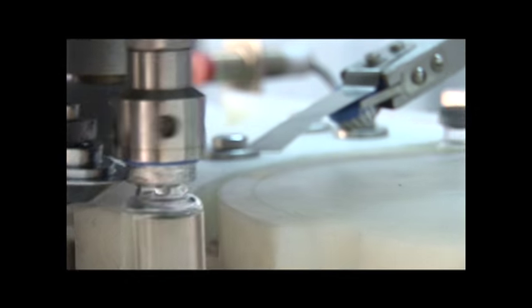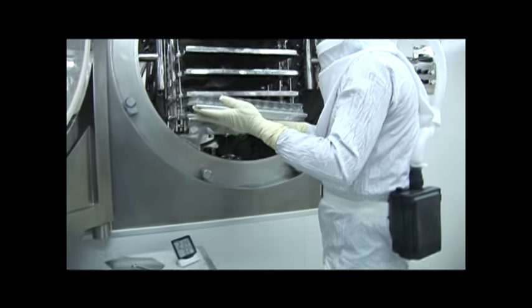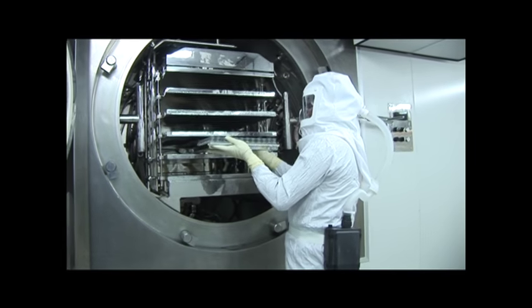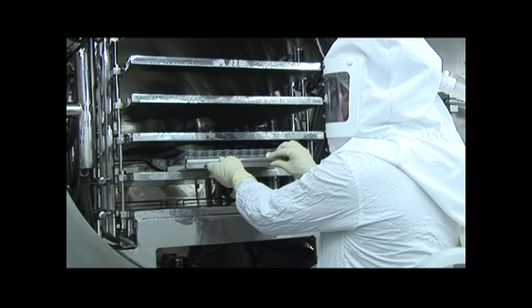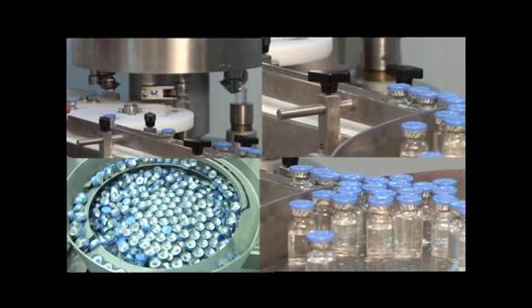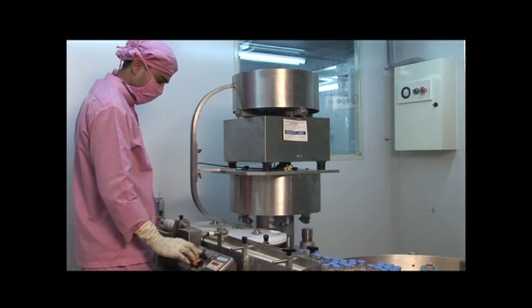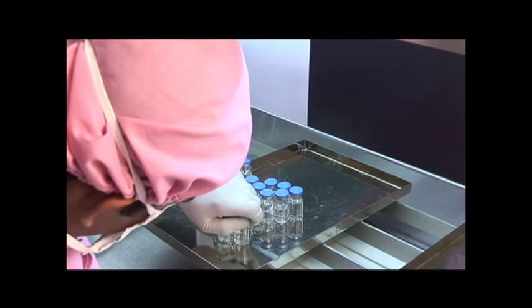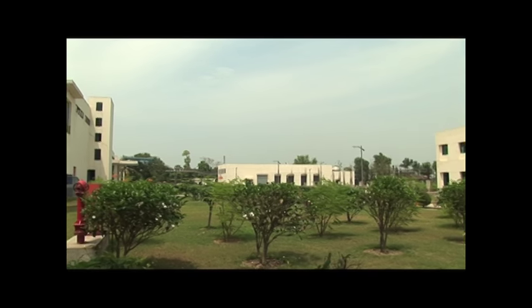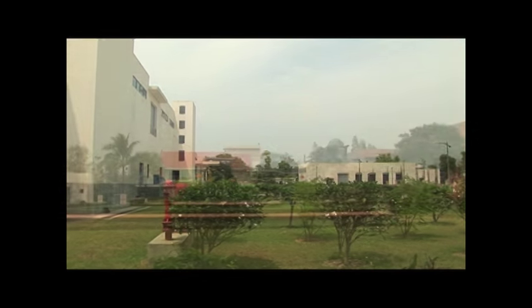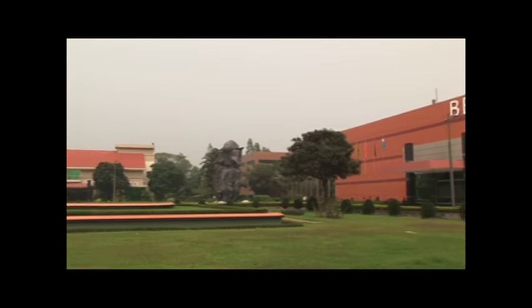Beacon, the first pharmaceuticals company in Bangladesh, introduces isolator technology for processing anti-cancer products which segregates people from the cytotoxic products and prevents exposure of products to the room environment. With unique manufacturing facility, today this promising company has an aspiration to serve humanity at home and abroad forever.